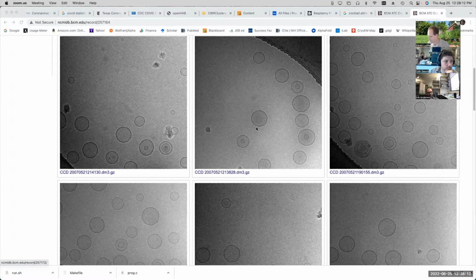If we look at the Fourier transform of this, you'll see lumps corresponding to the size of the lipid molecules and to the size of the tails and that sort of thing. There's a lot of structure in this, even if it's randomly structured. So if you look at the power spectrum of a lipid vesicle without any of the background noise, it's not going to be flat in Fourier space either. It's going to have all these lumps and features in it because of this texture that's present. So that sort of thing also isn't getting properly simulated.